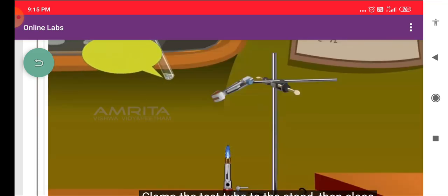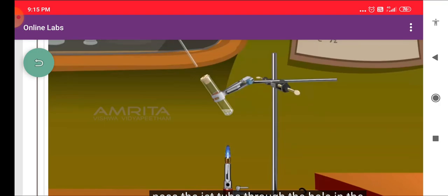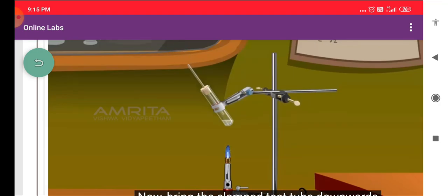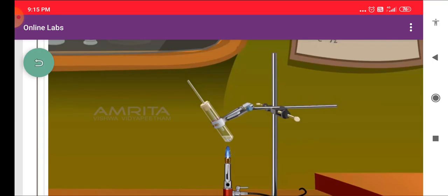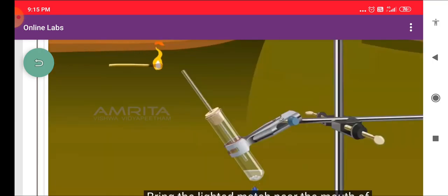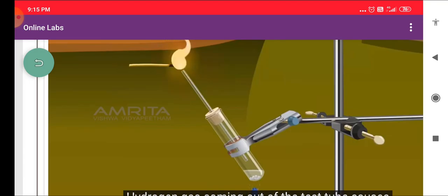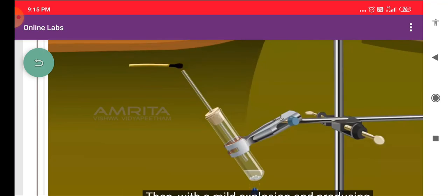Clamp the test tube to the stand, then close the mouth of the test tube with the cork and pass the jet tube through the hole in the cork into the test tube. Bring the clamped test tube downwards to heat it over the Bunsen burner. Hydrogen gas is evolved on heating. Take the match box and light a match stick. Bring the lighted match near the mouth of the jet tube. Hydrogen gas coming out causes the flame to flare up, then with a mild explosion and producing a popping sound, the flame dips out.